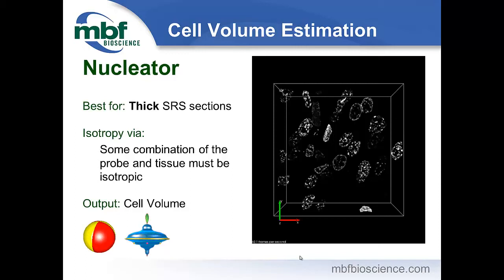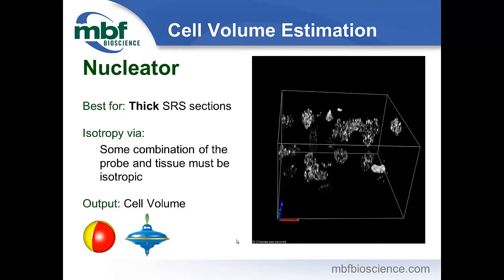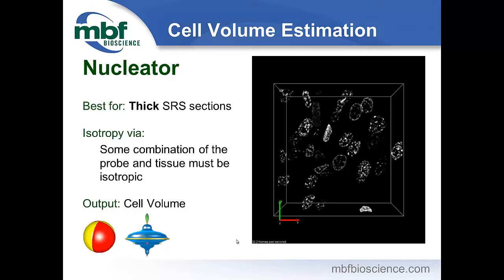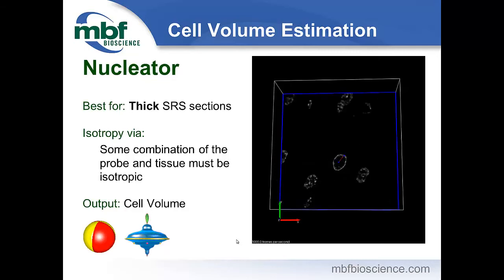And so we're going to use a probe that, rather than sectioning exhaustively through the cell and doing point counting, we can throw down a line and see how the line interacts with the particle, with the cell. So we have this same group of 36 cells. And rather than finding their tops, I want to look at one of them, and I'm going to pick a random point in the middle of the cell, and then put a line segment down to the edge of the cell, and that's the red line there.